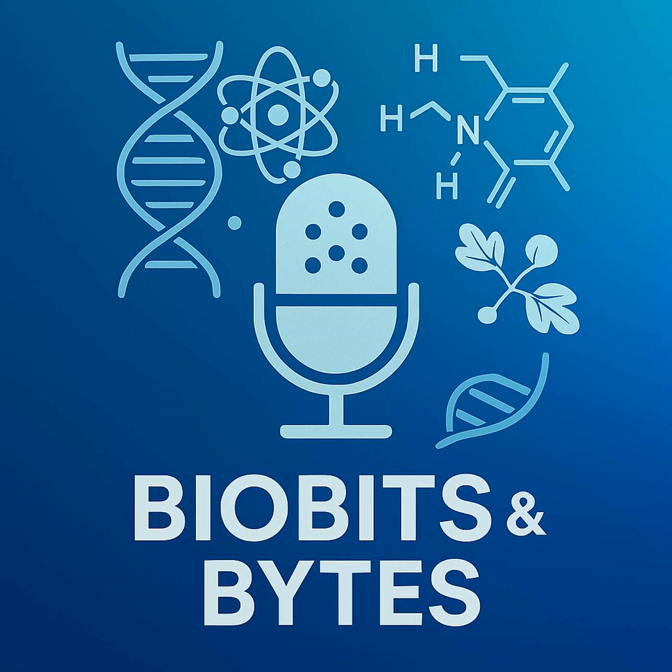Looking at the big picture then, why are blotting and ELISA just so foundational in molecular biology and biochemistry? They're fundamental because they give us windows into the molecules of life. They let us ask very specific questions about DNA, RNA, and proteins. Are they there? How much is there? What size are they? Are they interacting? This allows researchers to piece together how cells work, how diseases develop, how genes are controlled.